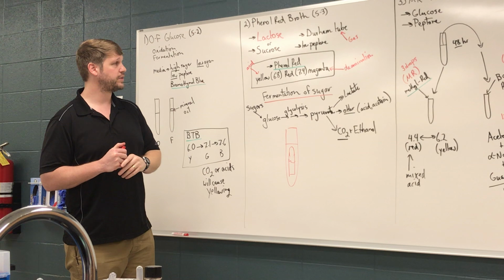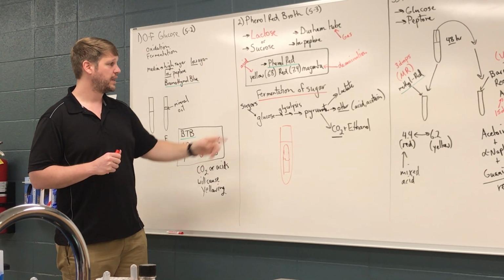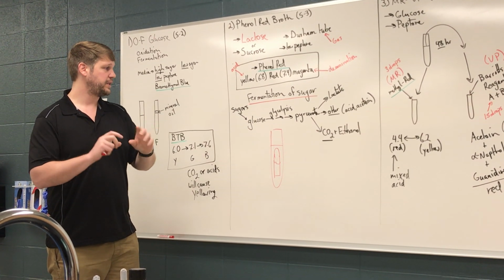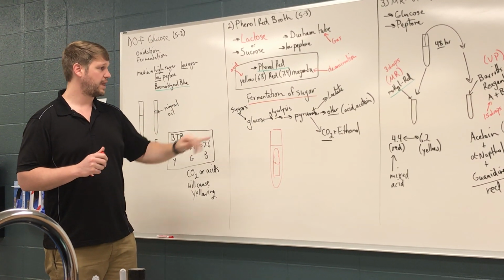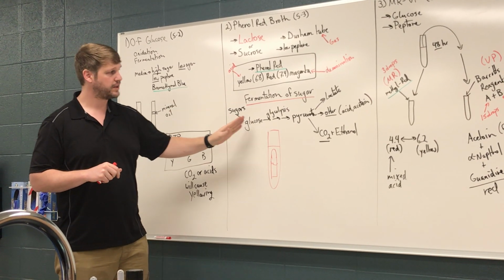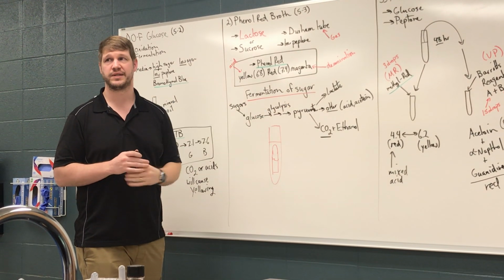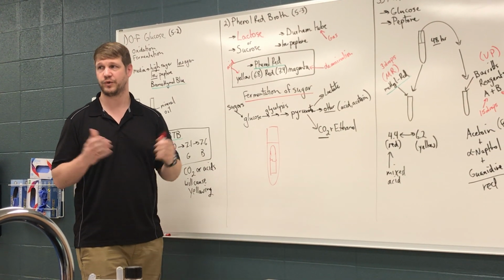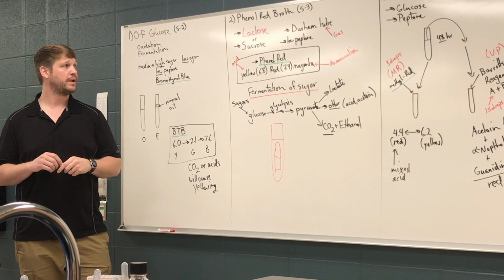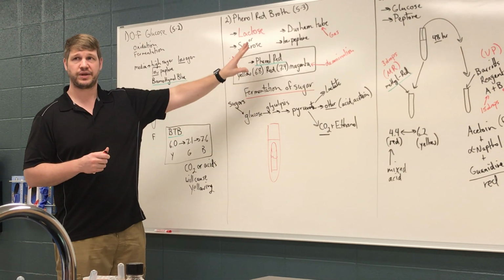We're testing two different sugars, lactose and sucrose. These are both disaccharides, both of which are going to be split, and then you'll have some sort of isomerization to convert each of the monosaccharides into glucose, then glycolysis to pyruvate, and then pyruvate fermented to some sort of organic end product. Any questions about that general concept?